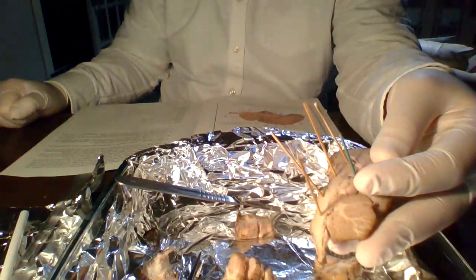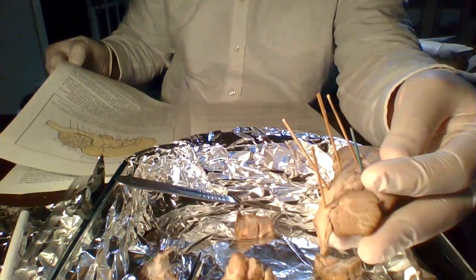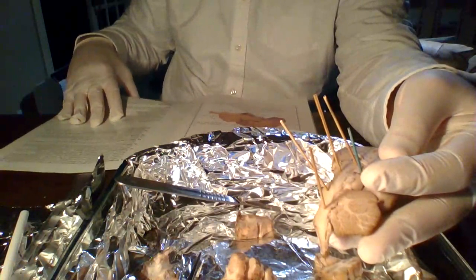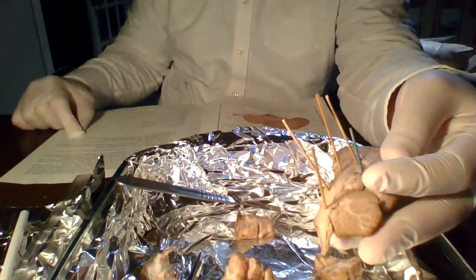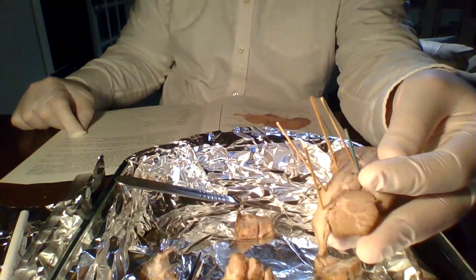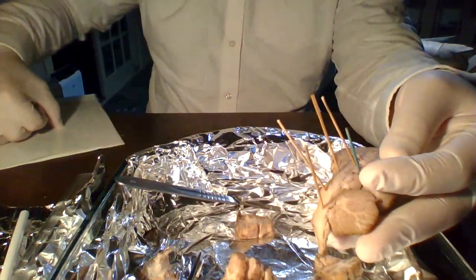The olfactory bulb we found, but okay. But hey, I just want to double check. Yeah, I was right earlier in the first episode. Okay.